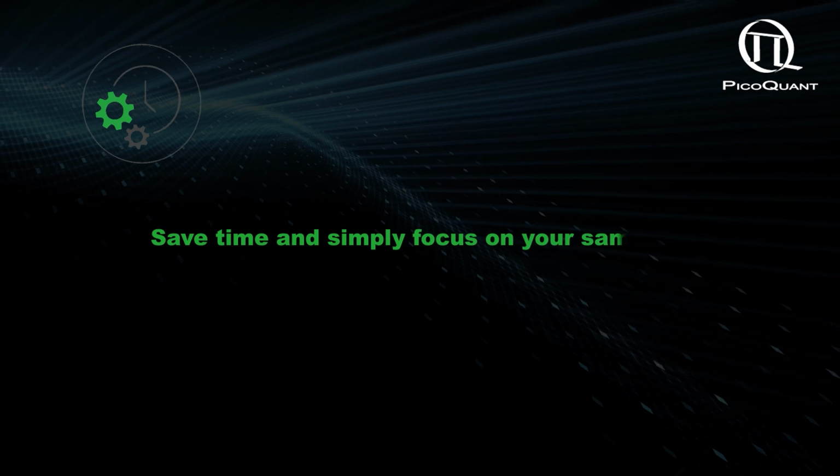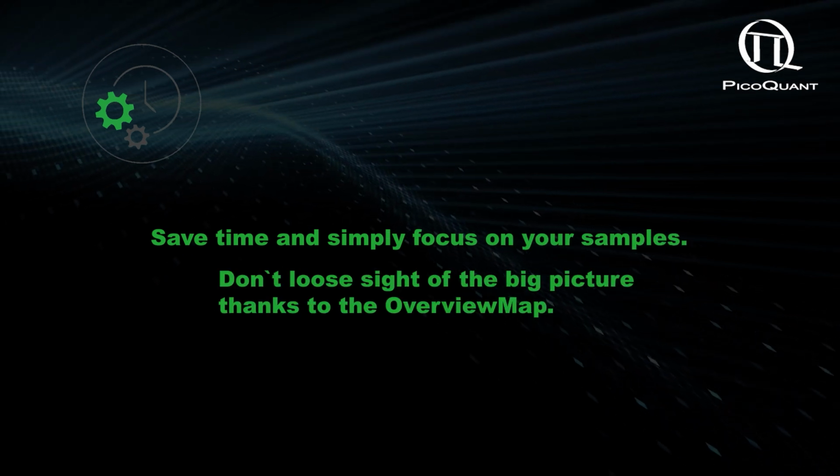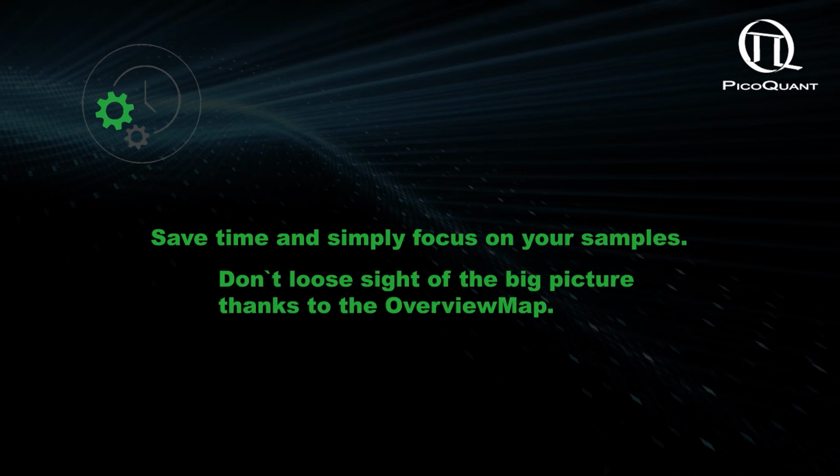Save time and simply focus on your samples. Don't lose sight of the big picture, thanks to the overview map.